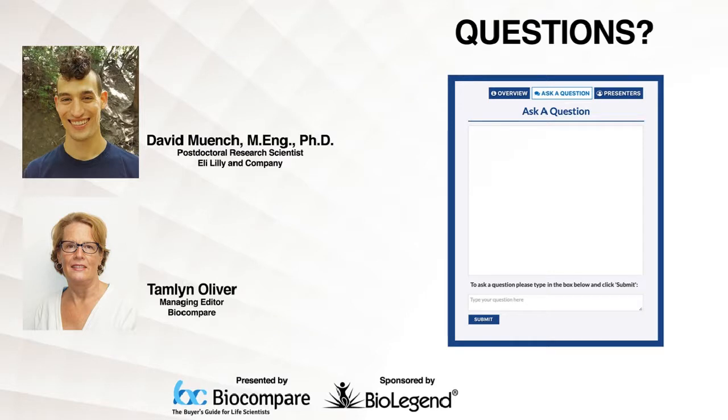I also want to take this opportunity to mention that all of the data that we've generated here is deposited in GEO, but on top of that, Nathan and Stuart from his group developed a gene viewer where you can visualize the expression pattern of your favorite genes in our data. You can see their expression patterns in both normal and GFI1 mutant single-cell data. And so a link to a website that lets you access this viewer is listed in our methods section of the paper. Hopefully you can check that out.